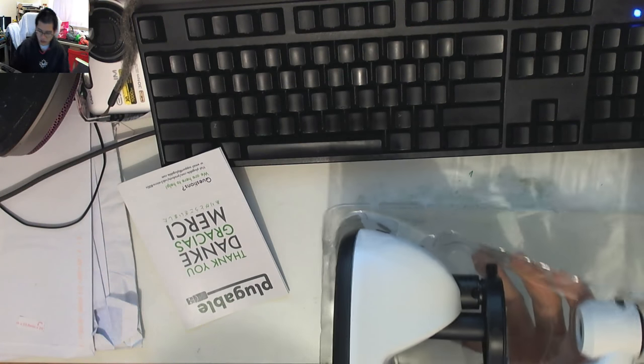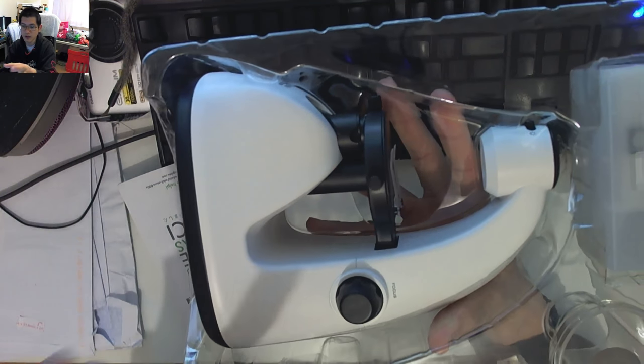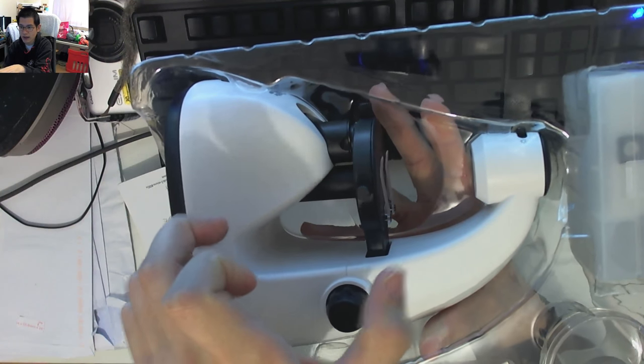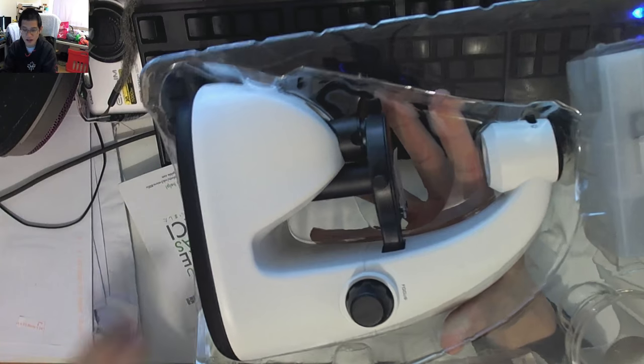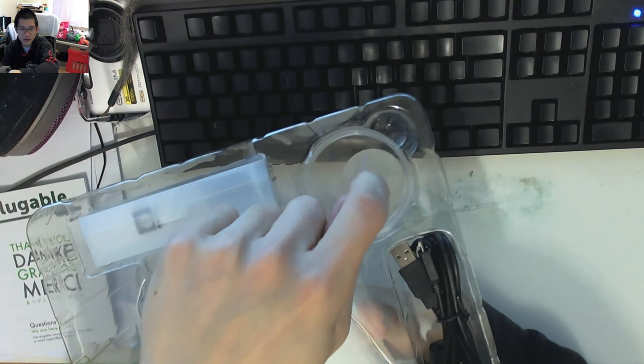Let's have a look and see what we get. Opening this in the right orientation so stuff doesn't fall out. It's fairly neatly packed with a molded plastic tray. There's a bit of paper which is the quick start manual guide. First impressions — it's big compared to the other unit which was much smaller. It is an inverted style, which I'll go into in more detail in a moment. That looks to be the accessories case, and there's a petri dish which looks like it's got a magnifier in it already.